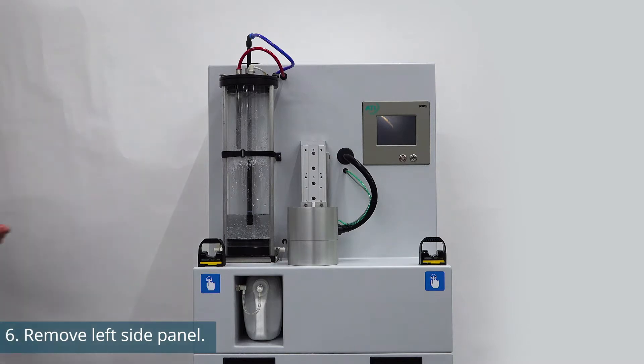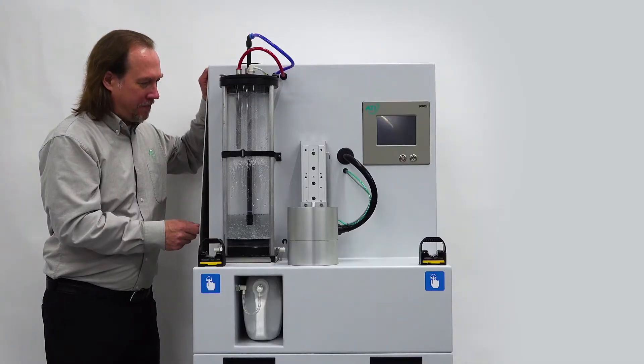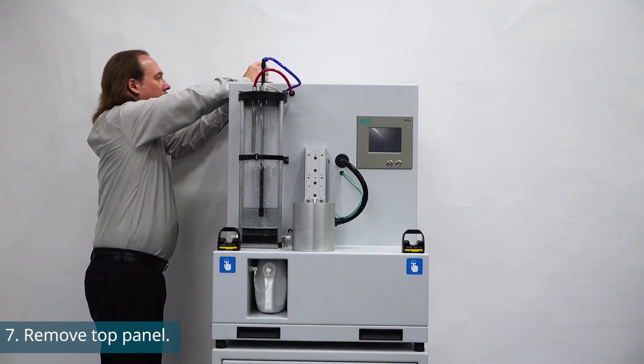Now remove the left side panel using a 2.5mm hex screwdriver. Next, take off the top panel by removing the four screws and place the panel to the side.